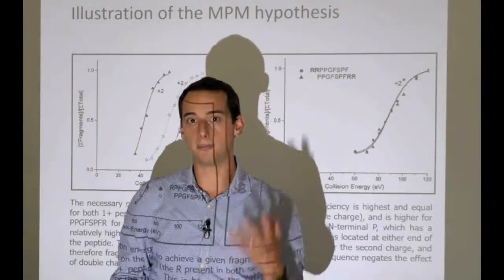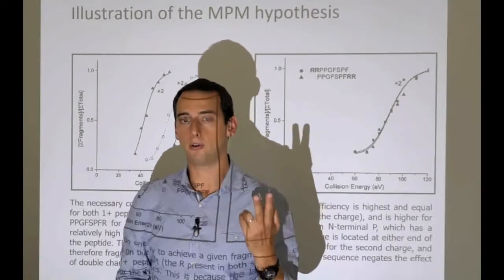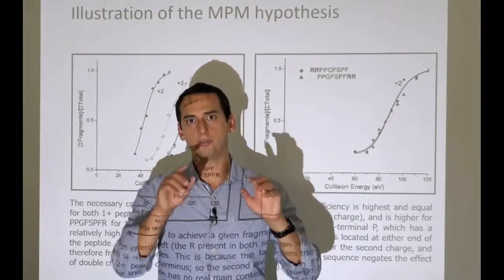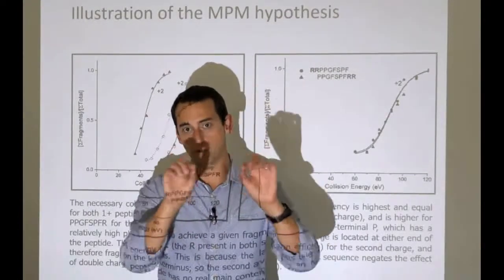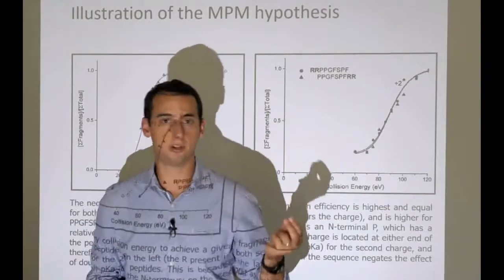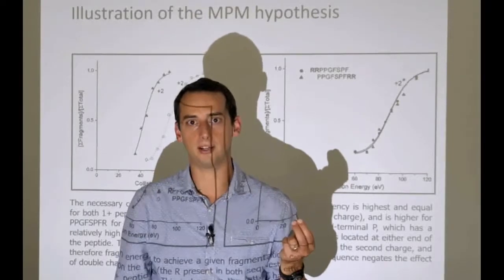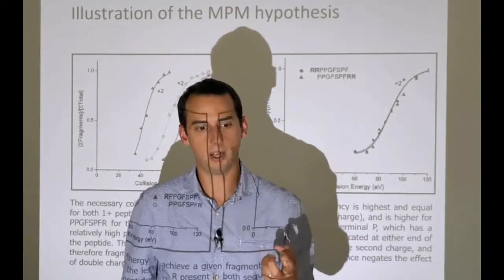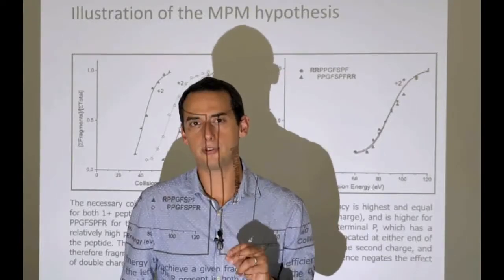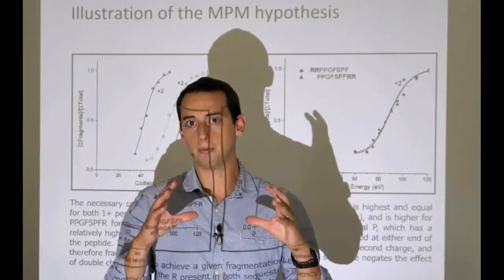So the carbon atom needs 4 bonds, or 4 electrons to share, and the oxygen only needs 2. So what people usually draw is a carbon atom connected to an oxygen atom by 3 bonds, so an exchange of 3 electrons, which puts a positive charge on the oxygen, and is extremely unlikely to happen because oxygen is quite electronegative and really likes to have electrons closely located to it. As a result, this is a very unstable kind of compound.